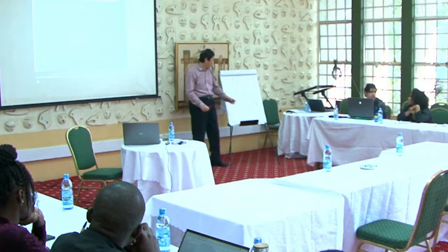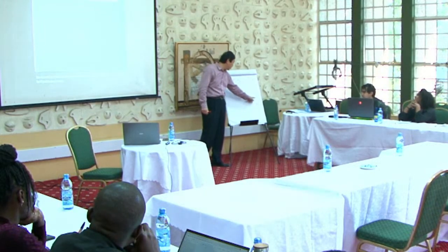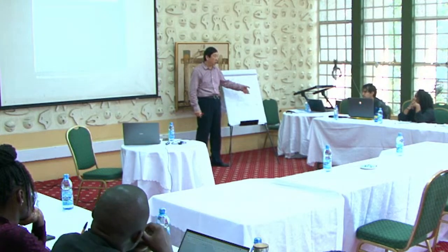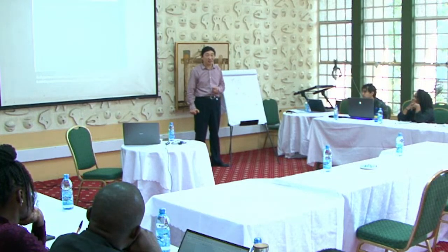Since if you have a branch, you break from the branch, so this secondary carbocation is strong, so you expect 43 to have a reasonable intensity, right?